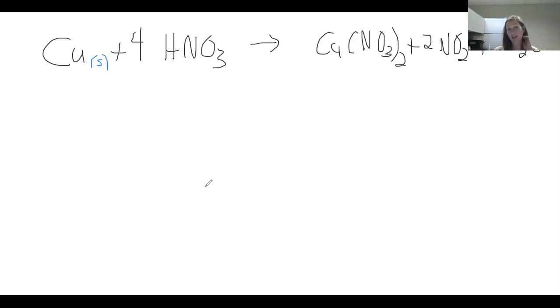Then that nitric acid that they added, it was a clear colorless solution. And now nitric acid, yes, the acid is a liquid, but we never use it in its pure 100% liquid form. So whenever you see acids, they're always aqueous, AQ, because they're always diluted with water. So it's actually HNO3 diluted with water, so it would be AQ, aqueous.